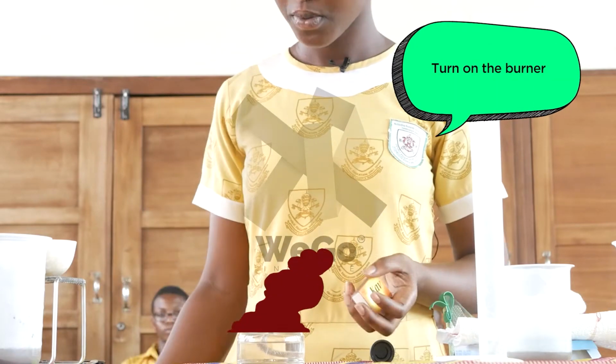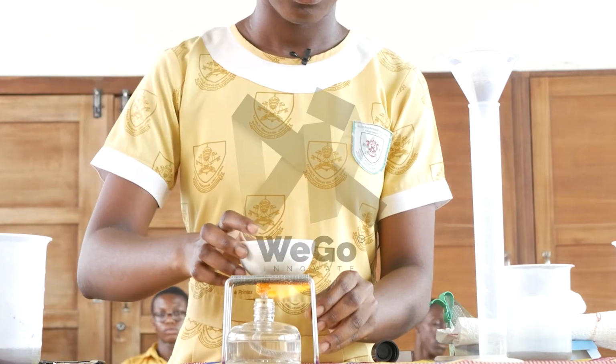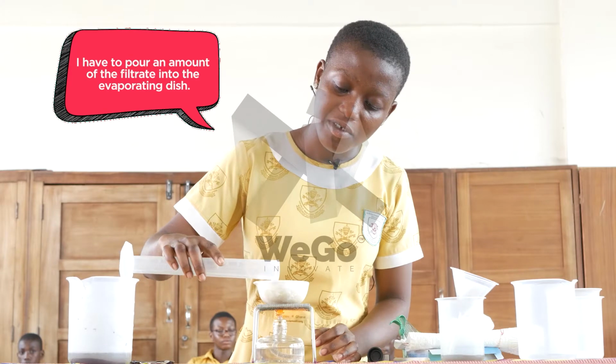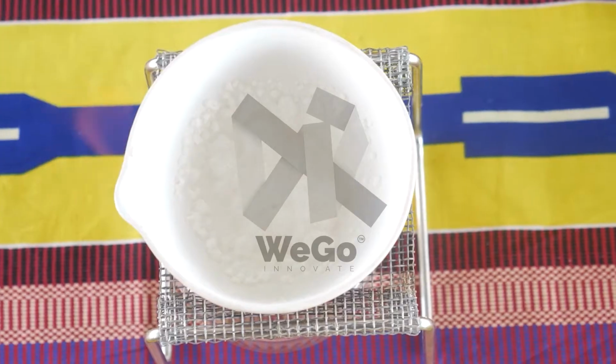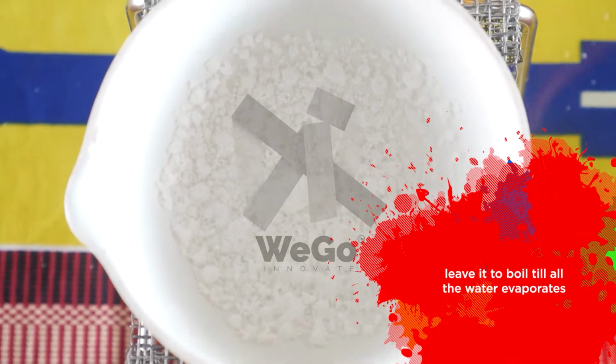Turn on the burner and place the evaporating dish on it. I'll have to pour an amount of the filtrate into the evaporating dish. Be careful around the fire. Leave it to boil until all the water evaporates.